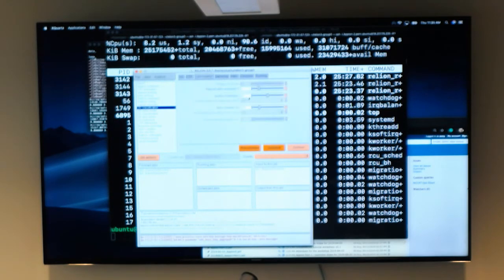And then in this case, if it's only done 22 and I said 25, I'll only do 3 more. So if I actually wanted to do 50 iterations, then I would have to say, okay, you're going to have to do 28 more by doing that. And then you can start that again.